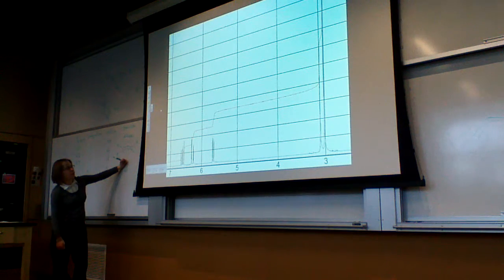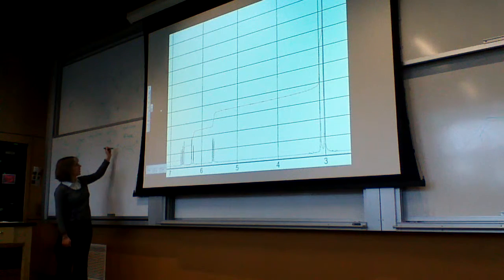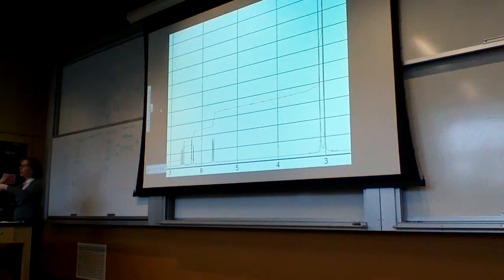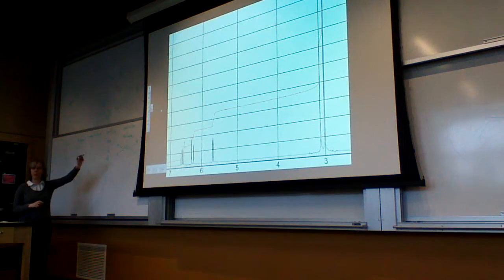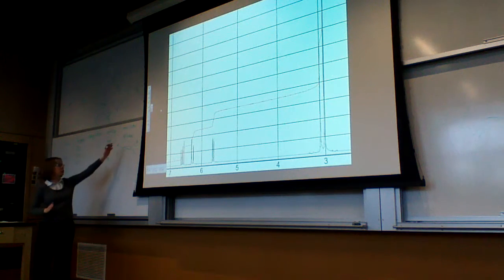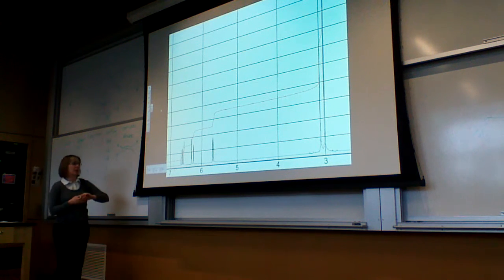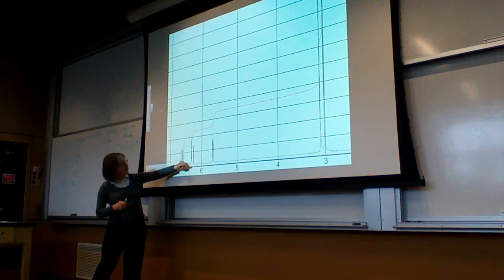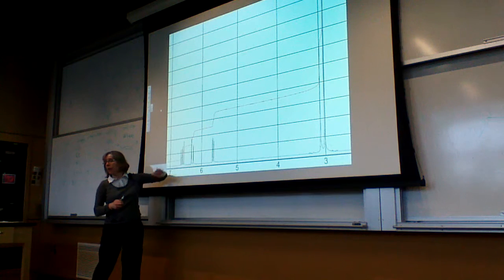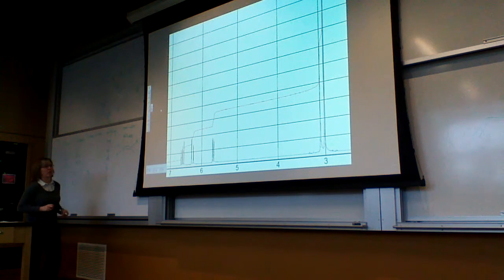The splitting, if you look at the alkene, you can't rotate around a double bond. And so each of these three peaks is going to be different on an alkene. Unless you have some type of symmetry around the alkene, that's always going to be the case, that you're going to see a different peak for all the different hydrogens attached to the alkene. And it has the more complex splitting that we'll talk about later. Actually, if you look at this even closer, there is very, very fine splitting, probably from a longer distance coupling.